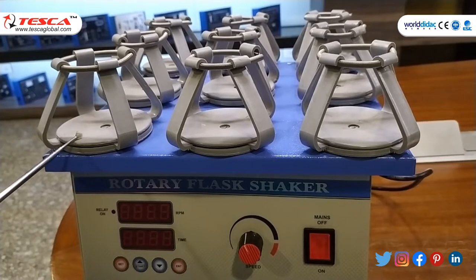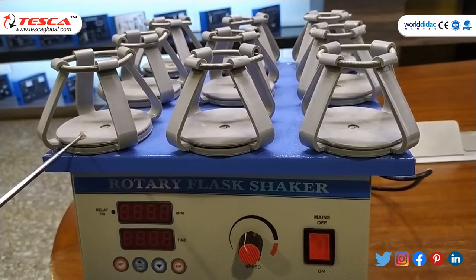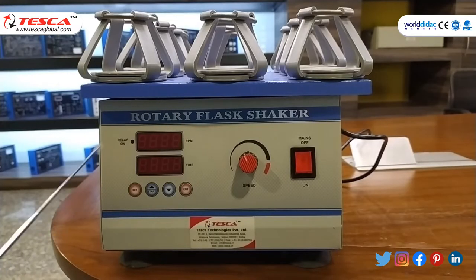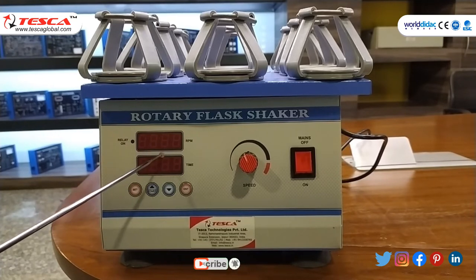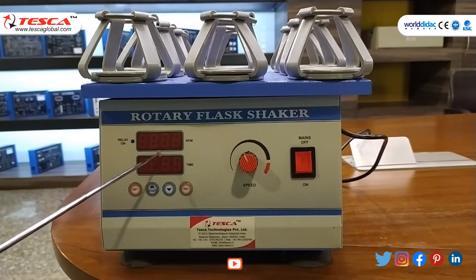There are 9 flask holders with an orbital diameter of 25mm. In the control panel there is a main on/off button and a speed control knob. The rotary flask shaker is equipped with a highly accurate digital timer and RPM display, and the standard speed is between 20 to 50 RPM.